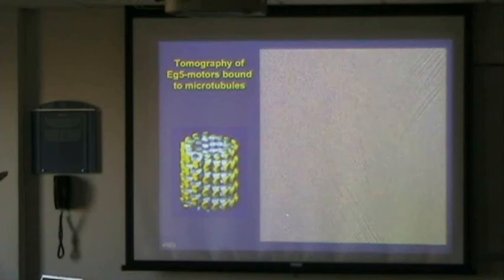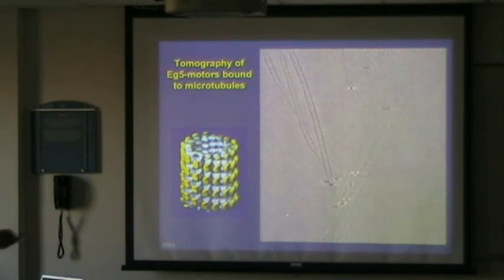Also this is always the lumen here. They are cut a little bit at an angle, so you cut through the bottom at some point and then through the top at the other. But these are this kind of 3D representation of this kind of structure. And then we can continue.